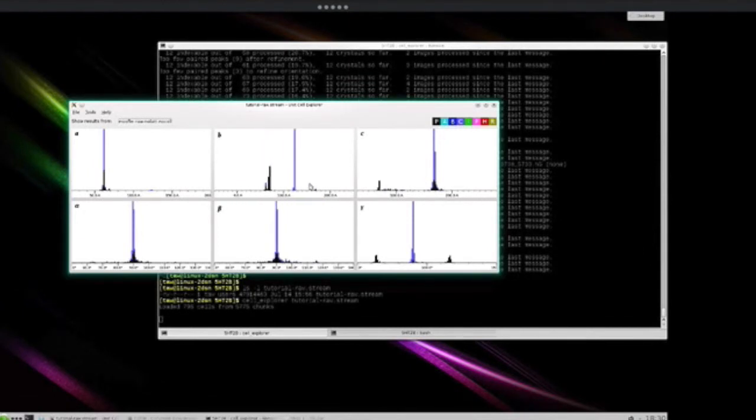So these graphs, you can click and drag to move them. Using the mouse scroll wheel, you can zoom in and you can zoom out. You can change the binning by pressing plus or minus. So let's zoom into this peak, make it look really smooth. The colors of the bars indicate the centering. So this sort of purpley color, as shown on the color key at the top right, represents C centering, and the black ones represent primitive P cell. Just in passing, if you have difficulty distinguishing the colors, you can just click them and they'll switch to black, so you can highlight what they are.